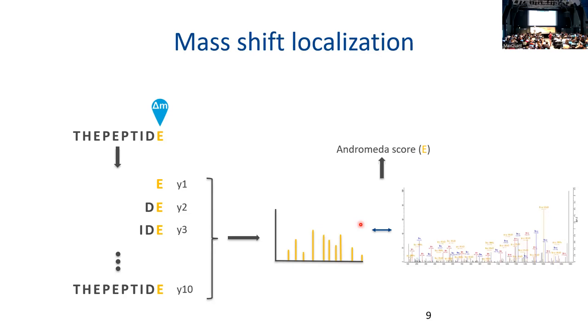But here in dependent peptide search, we don't know prior to the search which modification we are working with. That's why we're checking. It can be phosphorylation, dehydration, any modification, even cleavage. So that's why dependent peptide search incorporates this checking of every amino acid. It's not a computational question, it's a question of what we're looking for. If you're looking for a specific modification and you know which amino acids are usually modified, then you should probably specify it during a conventional search.